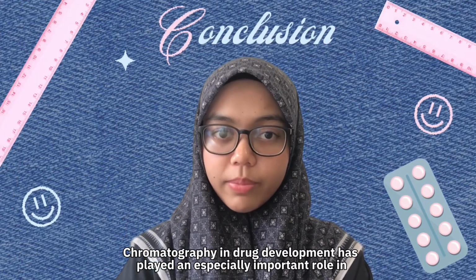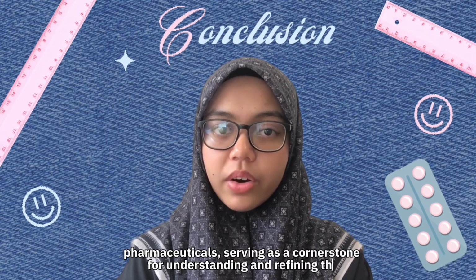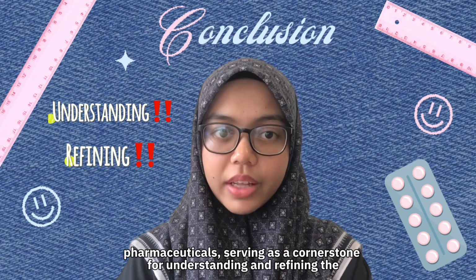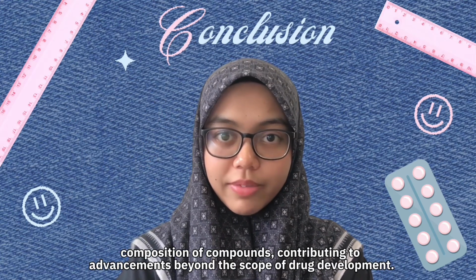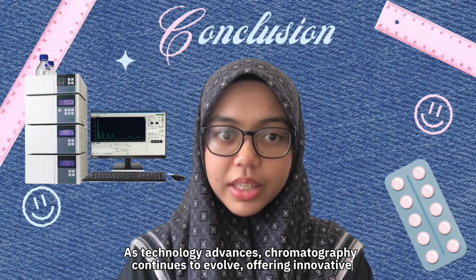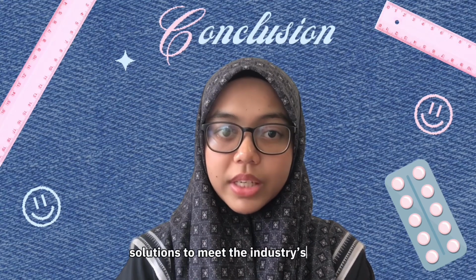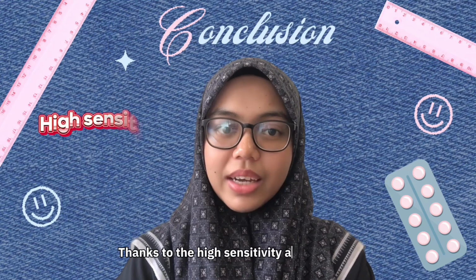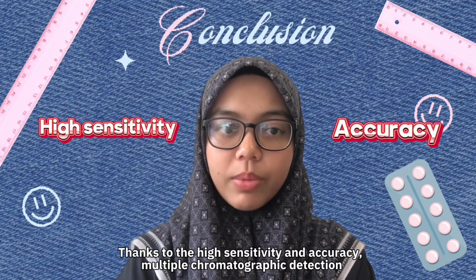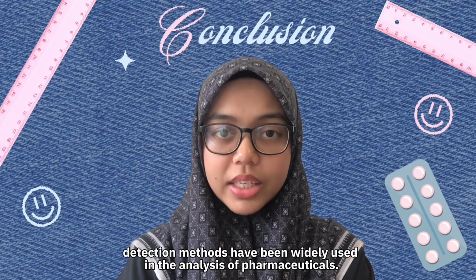So, as the conclusion, chromatography in drug development has played an especially important role in pharmaceuticals, serving as a cornerstone for understanding and refining the composition of compounds, contributing to advancements beyond the scope of drug development. As technology advances, chromatography continues to evolve, offering innovative solutions to meet the industry's growing demands for efficiency and reliability. Thanks to the high sensitivity and accuracy, multiple chromatographic detection methods have been widely used in the analysis of pharmaceuticals.